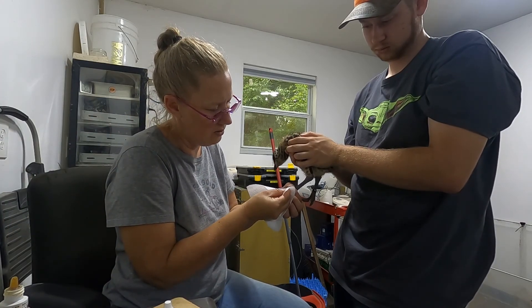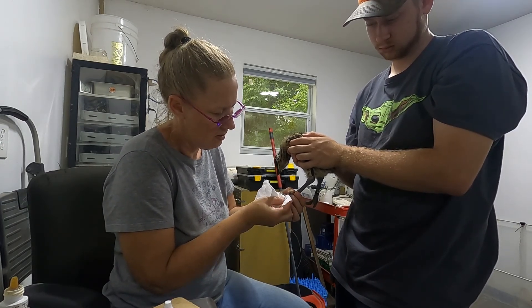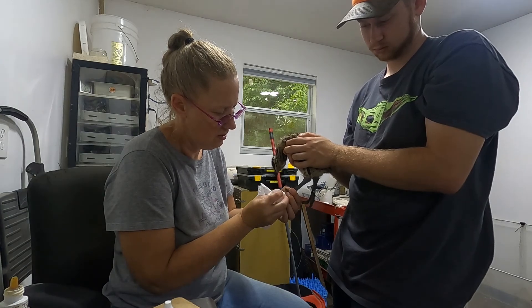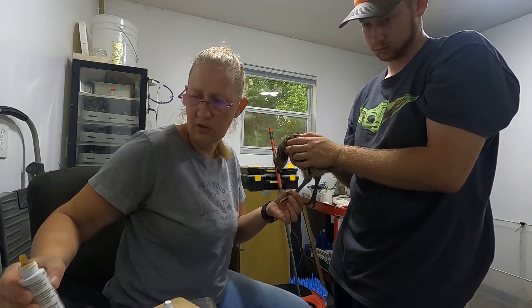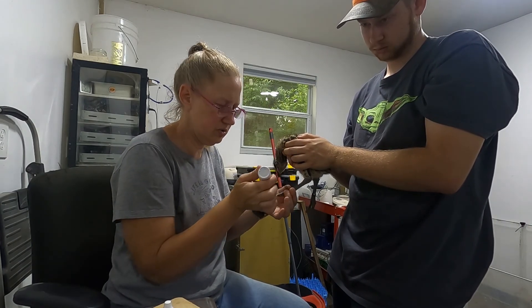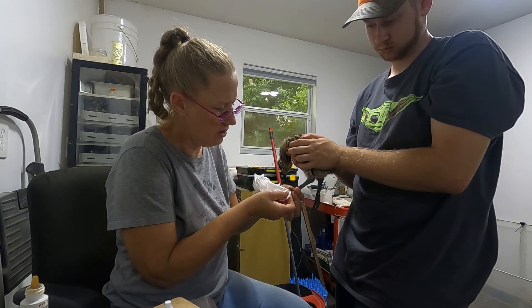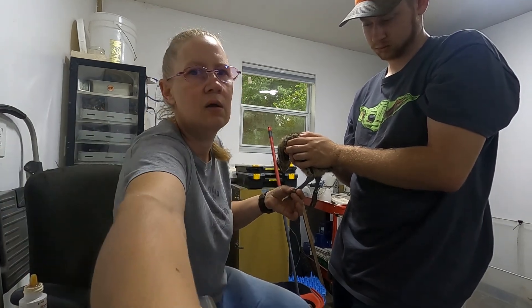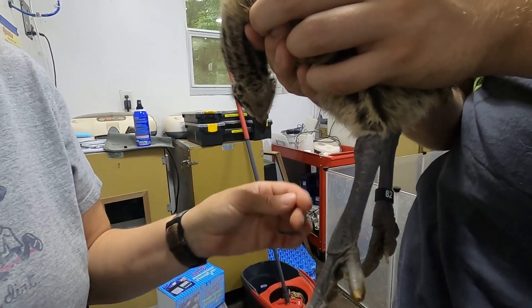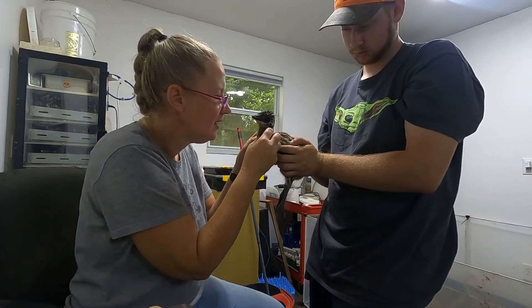We'll go ahead and let this set up for a minute and make sure that it stops bleeding. As long as it's not actively bleeding I don't worry about it too much. We will check them later in the day and make sure that it hasn't been broke open again, but the gel on there stops it pretty quick. We'll zoom in here a little bit — you can see it just kind of seals it over. And then this little guy, hi little one or girl, since we don't know yet, is ready to go.